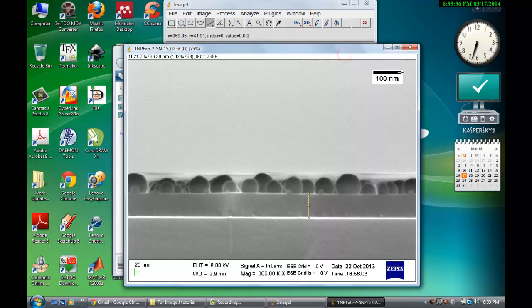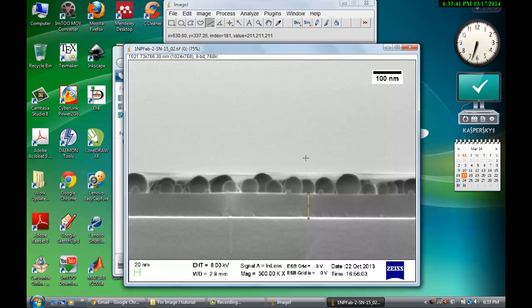So see, this image has now a scale bar at the corner which is calibrated.